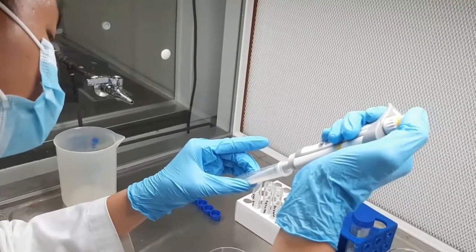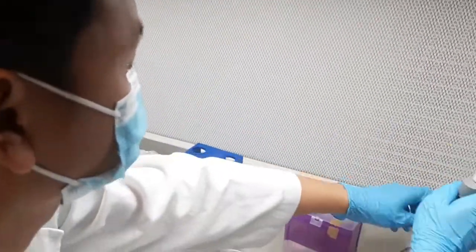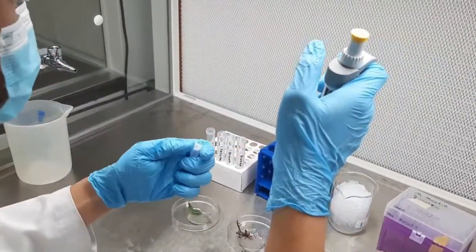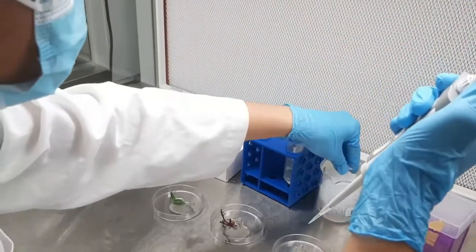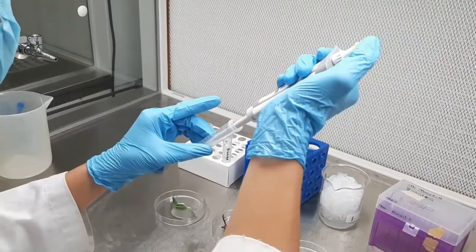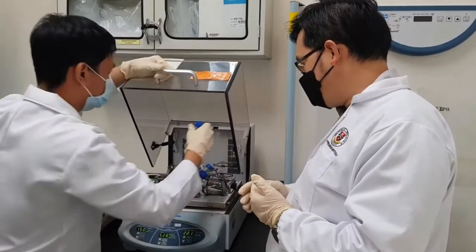Using our method, we were able to isolate protoplasts from two varieties of both Kappaphycus alvarezii and Kappaphycus striatus, yielding approximately 30,000 cells per 0.1 gram fresh weight of parent tissue, with cell sizes ranging from 100 to 200 micrometers. The protoplasts were grown in a growth medium to regenerate the cell wall, which is required for the cells to be fully exploited and potentially used in hybridization or protoplast fusion to produce hybrids with improved characteristics such as higher yield, increased disease resistance, and greater resilience to climate change.